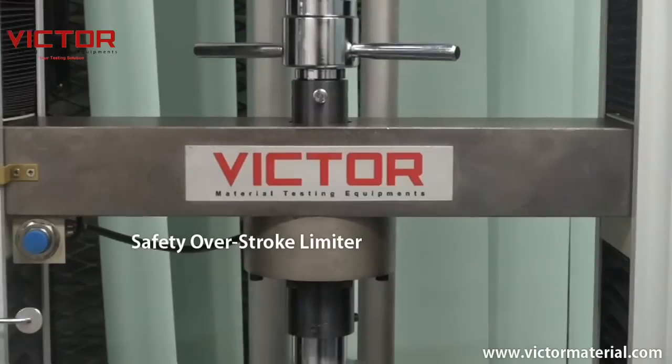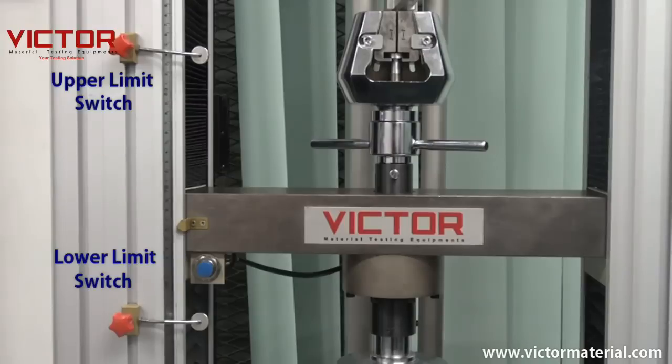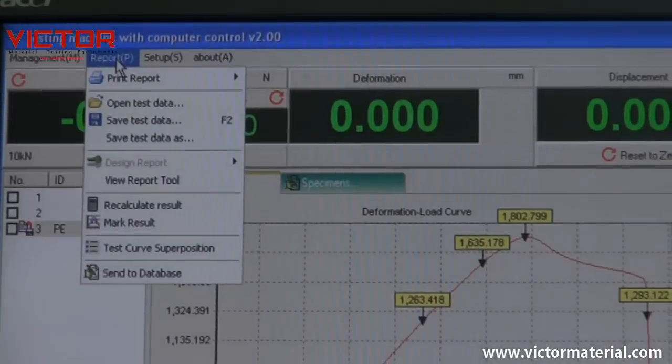Safety overstroke limiter: the range of the crosshead movement is mechanically limited by an upper and lower limit switch for the prevention of over-travelling. Emergency stop control is also provided to shut down the equipment immediately should there be an abnormality.